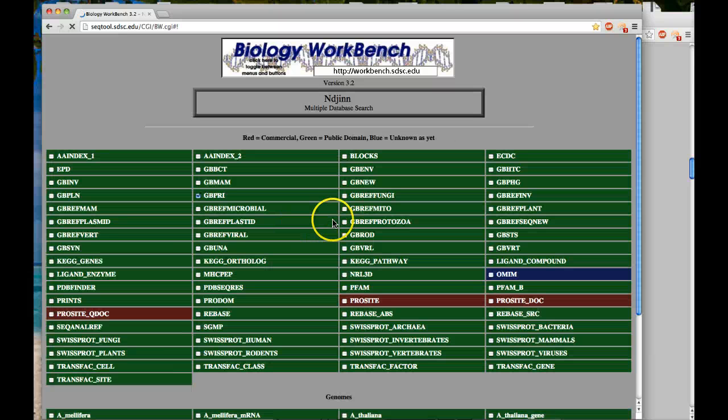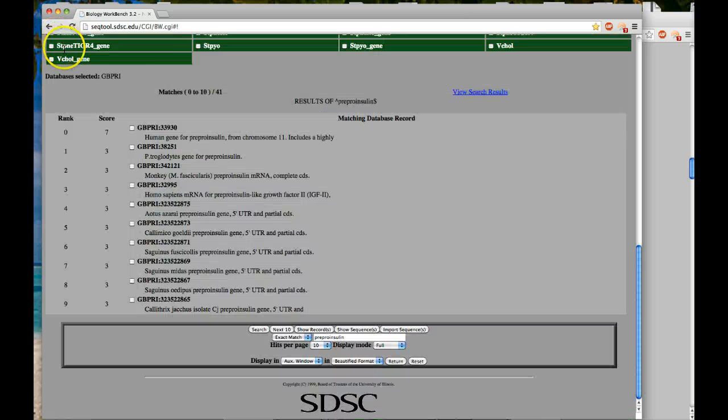And it's going to take a little bit. One of the key things I give you on the PDF for this is try not to use these back and forth buttons up here, because your computer is talking to a supercomputer down in San Diego, and you can get messed up on things if you try using those buttons instead. Instead, you want to hit return. That'll get you back to a window and you won't lose any data.